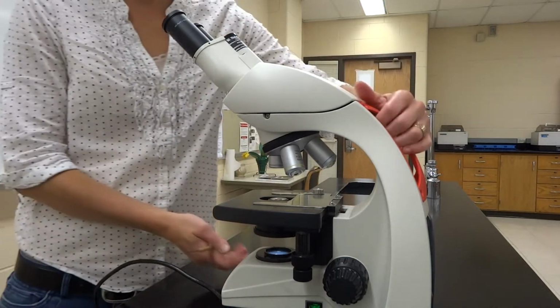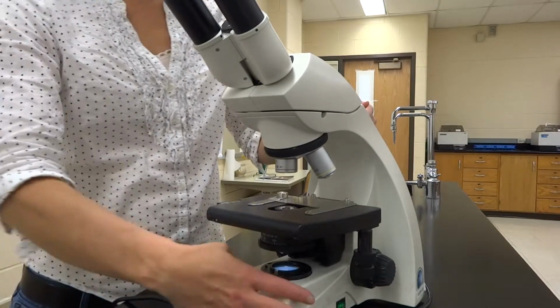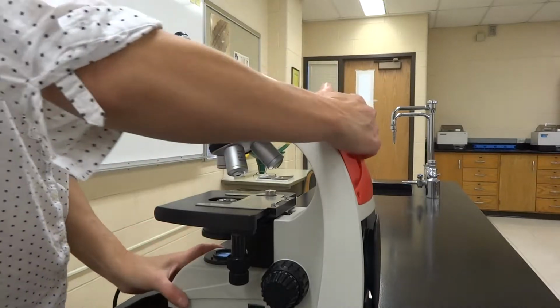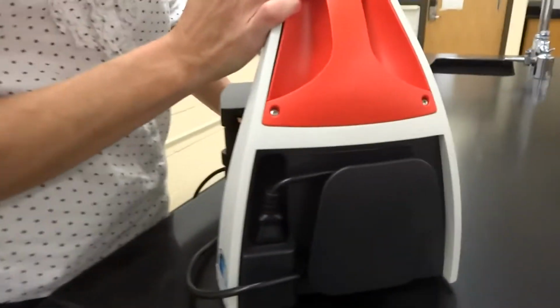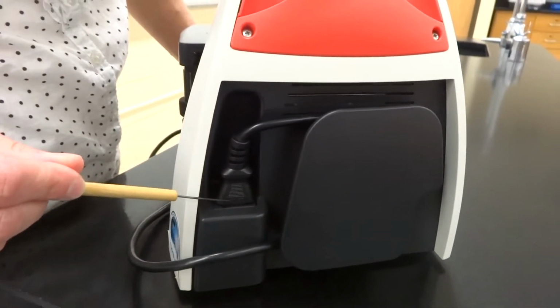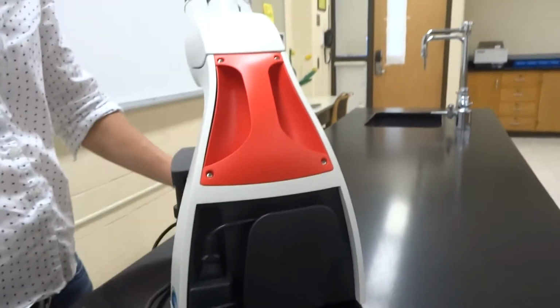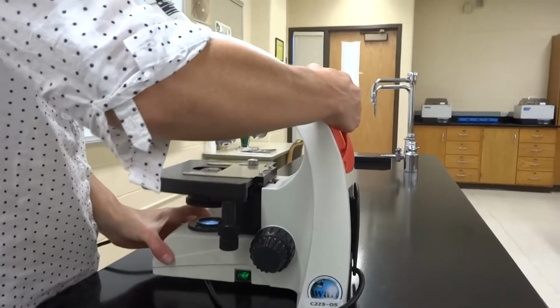If that doesn't happen, there are really two things you should do. A, make sure it's plugged in. And B, at the back of your microscope, which we just moved, there's an insertion for the other side of the plug that gets really loose easily. So make sure that goes in so that you can get your light. Electricity! All right, so we've got our electricity.